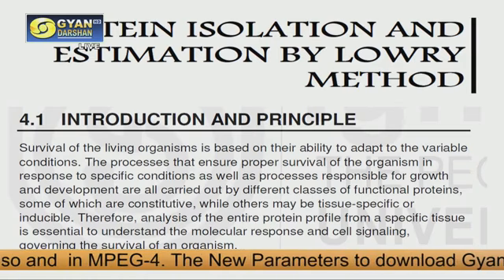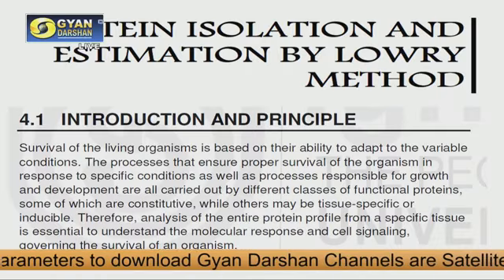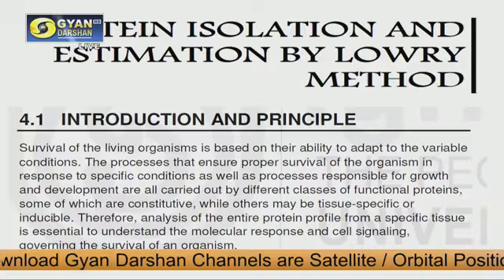So there are several such proteins within the body of an organism, some of which are expressed continuously and some of which are expressed in response to a particular situation, whether constitutive or inducible, whatever, we need to isolate the protein. We need to isolate the total protein content. So for that we have a protocol, depending on the source from where you are isolating the protein. That is important.